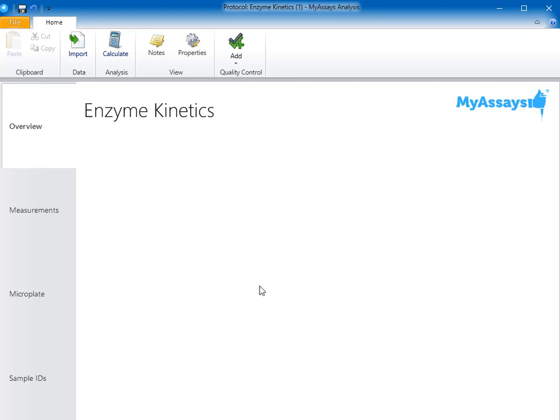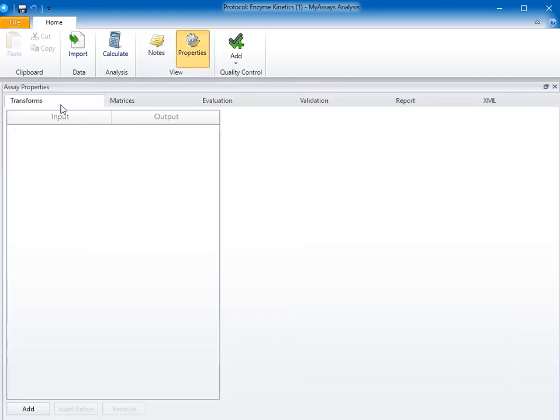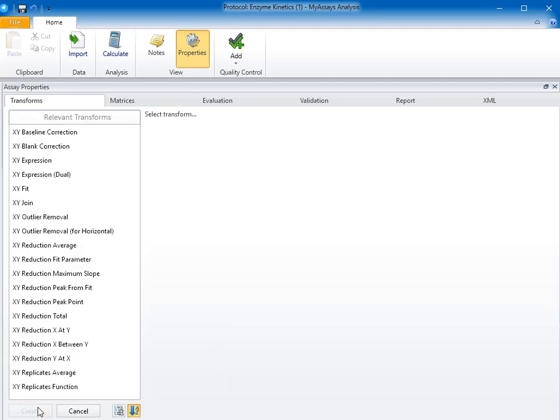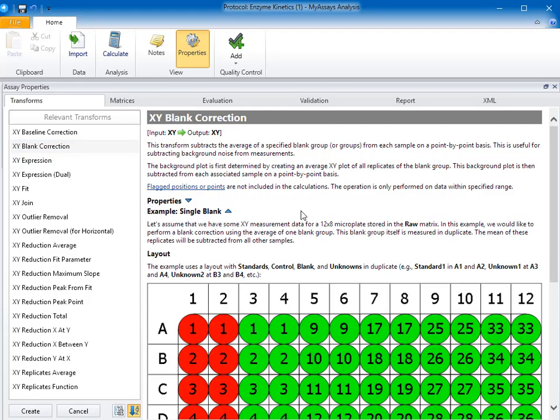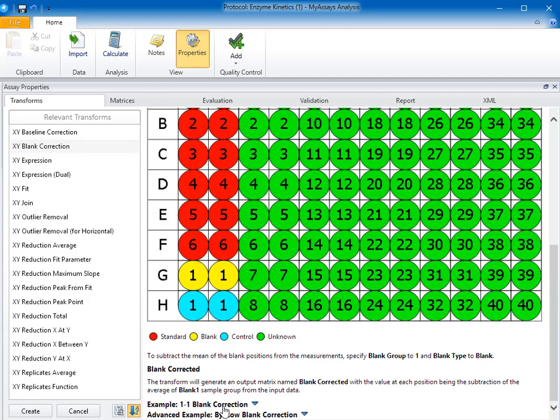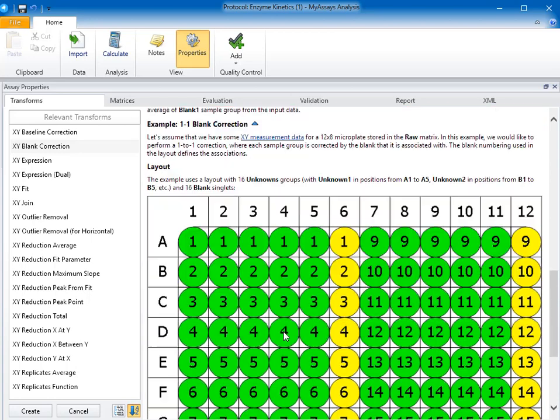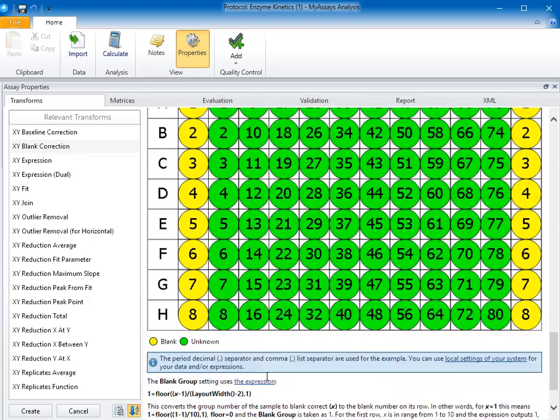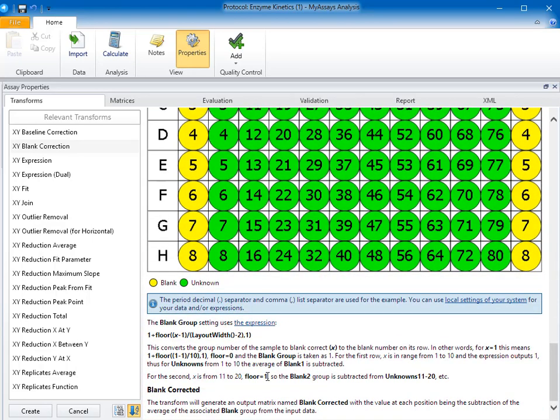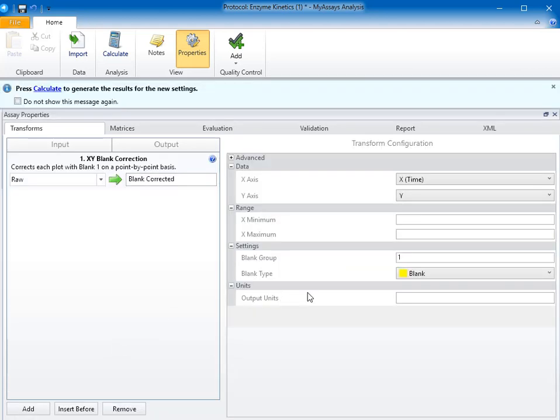To begin adding these steps, I'll open the Properties control and start on the Transforms tab. The first step for my data analysis will be to add a blank correction transform. I'll click Add and select XY blank correction. There are several different ways a blank or background correction step can be performed. You can perform a blank correction using a single blank, a one-to-one blank correction, which corrects each sample using its associated blank, or you can perform a blank correction by row, which corrects all samples in a row with the corresponding blank. In my case, I have a single blank for the plate. So I'll click Create, set the blank type to blank, and the blank group to 1.